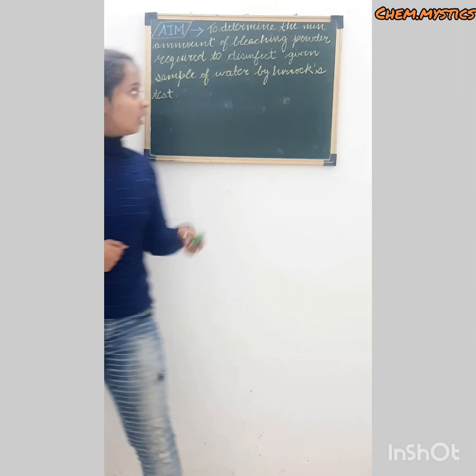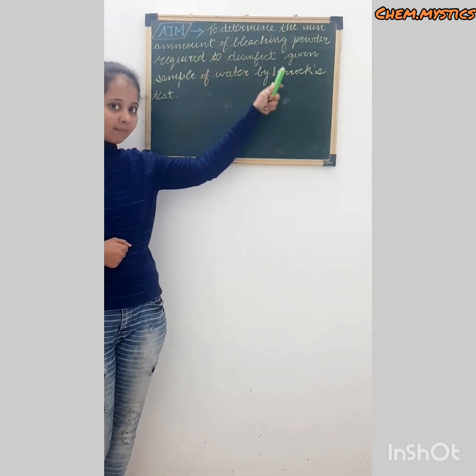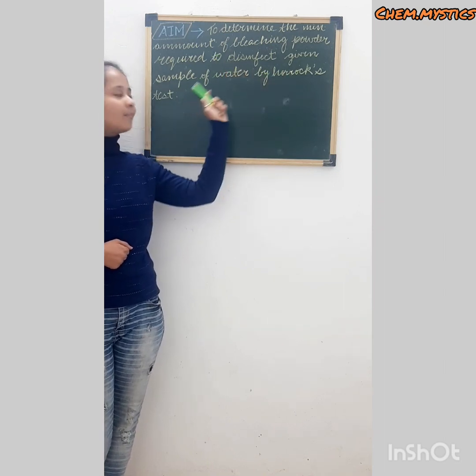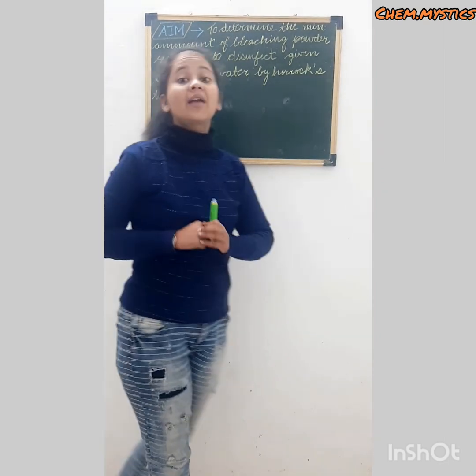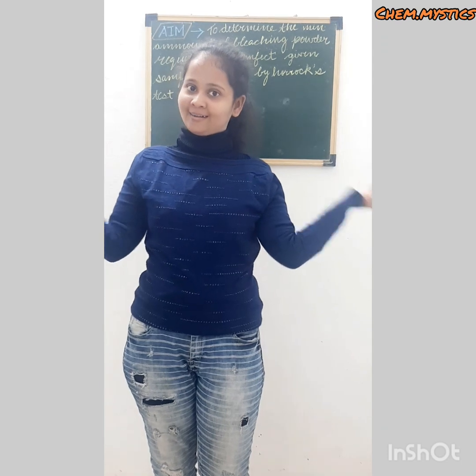The aim is to determine the minimum amount of bleaching powder that is required to disinfect a given sample of water by Horrock's test. So, get ready to experience the miracles of chemistry with Garima.